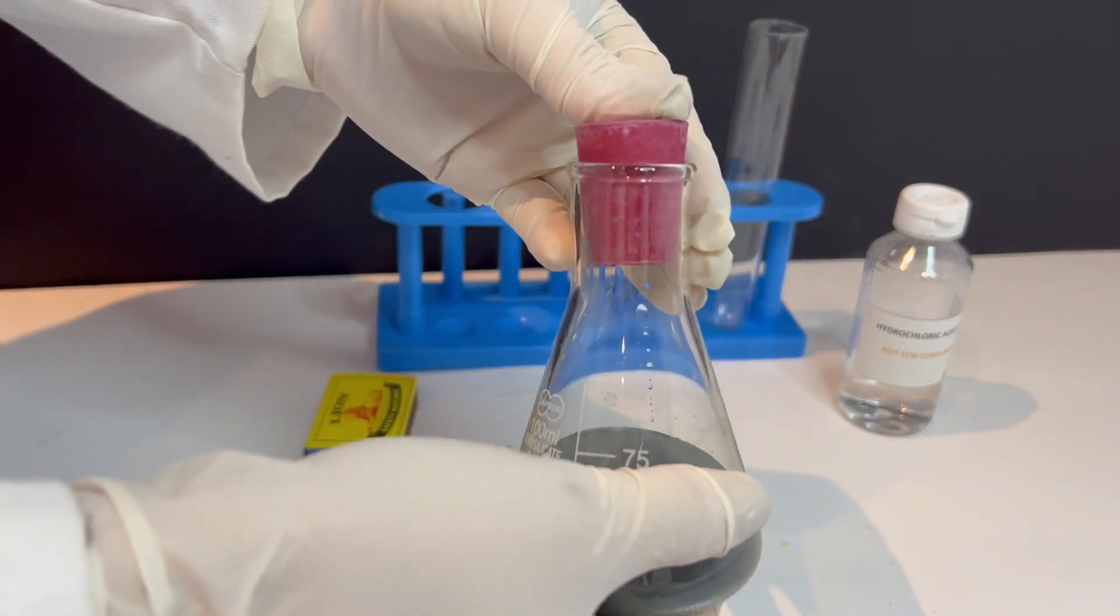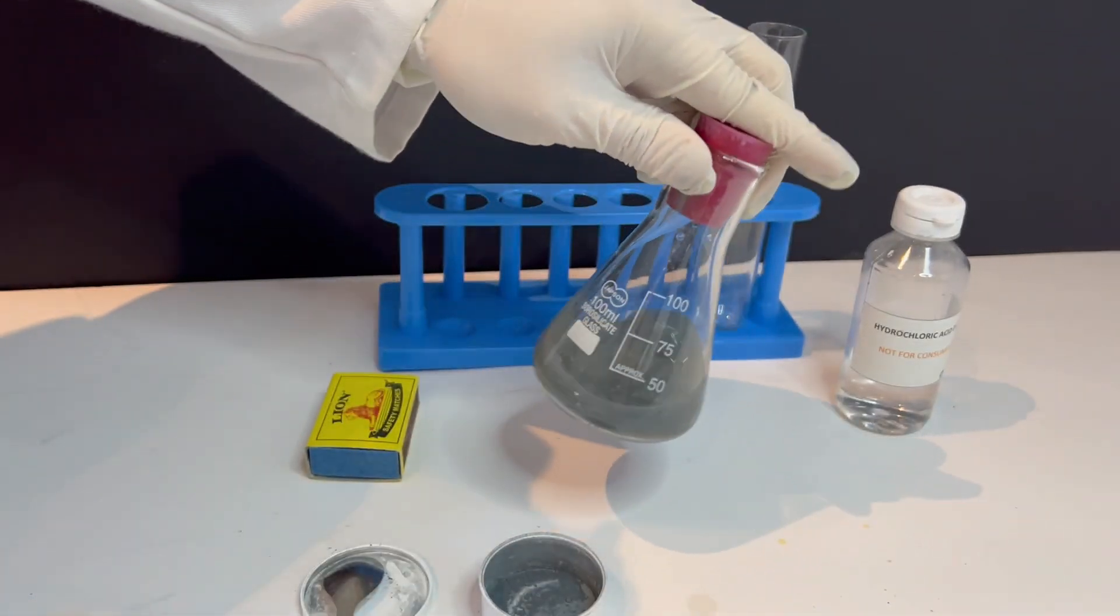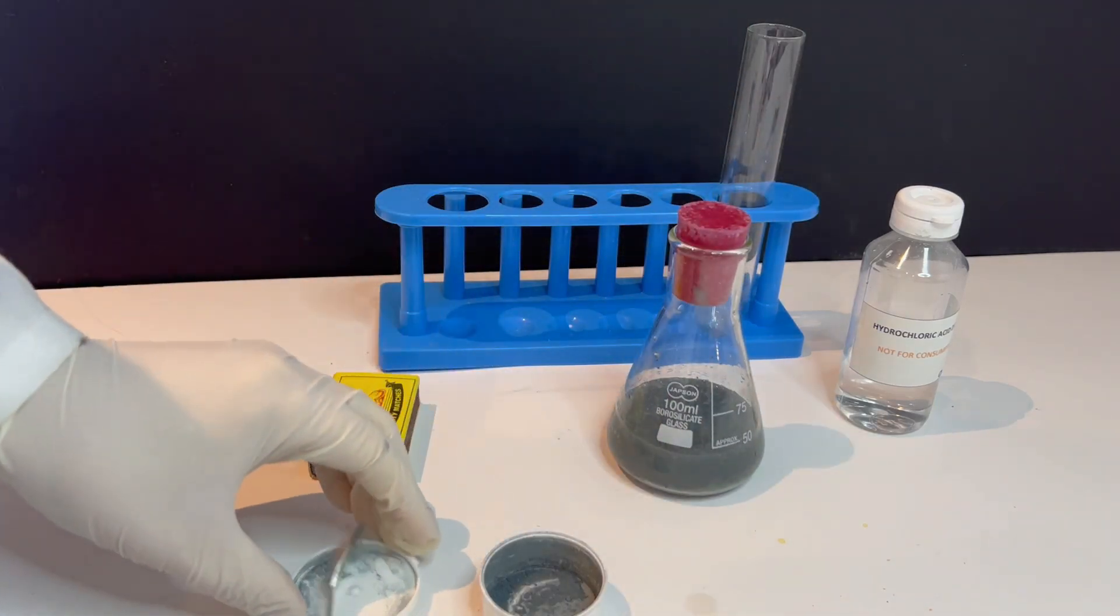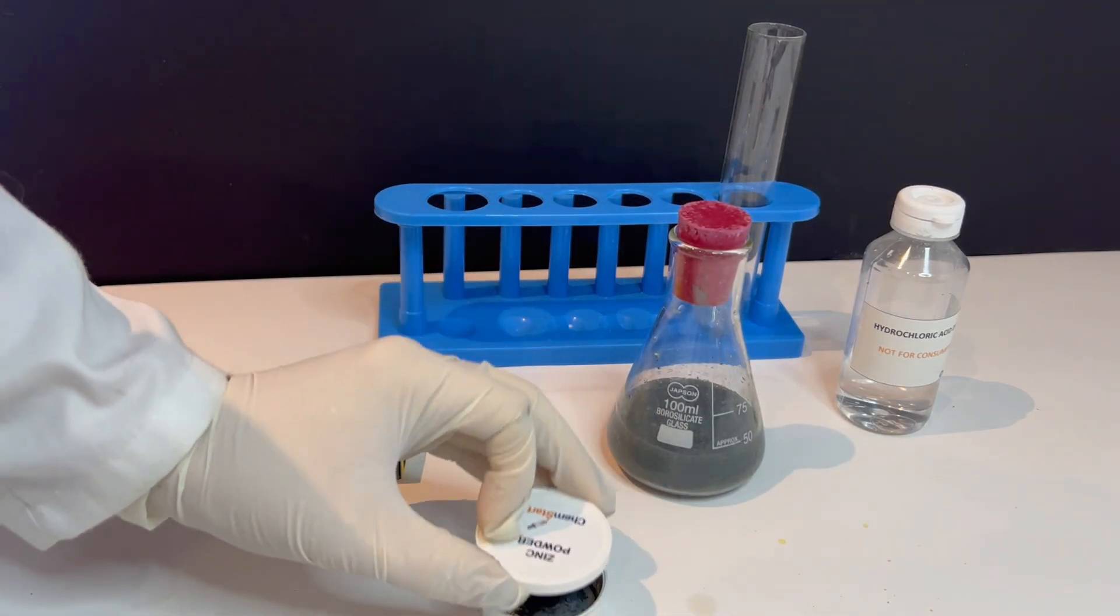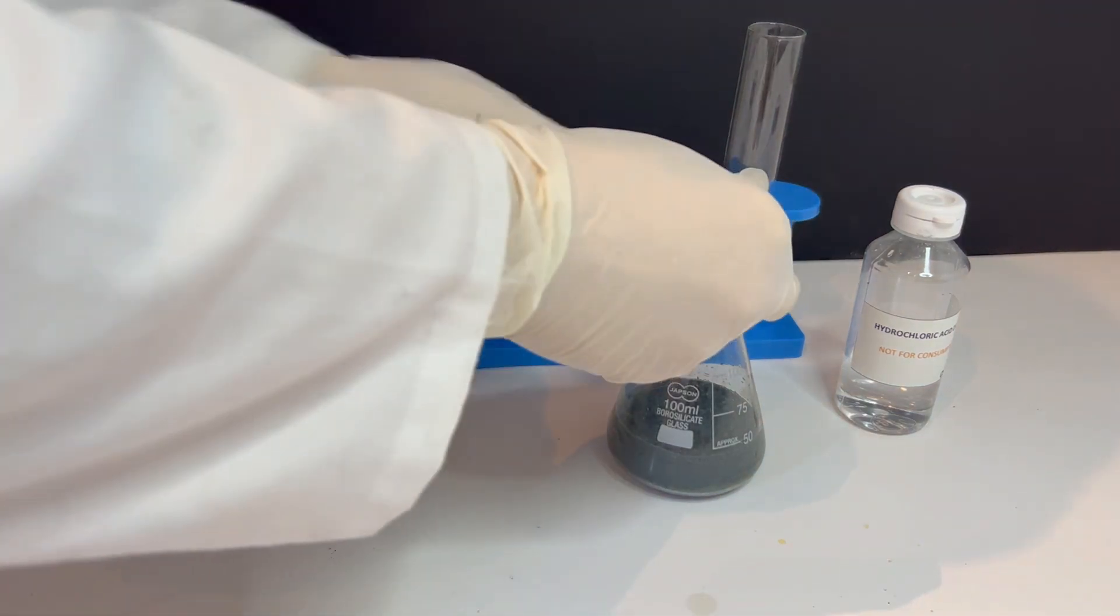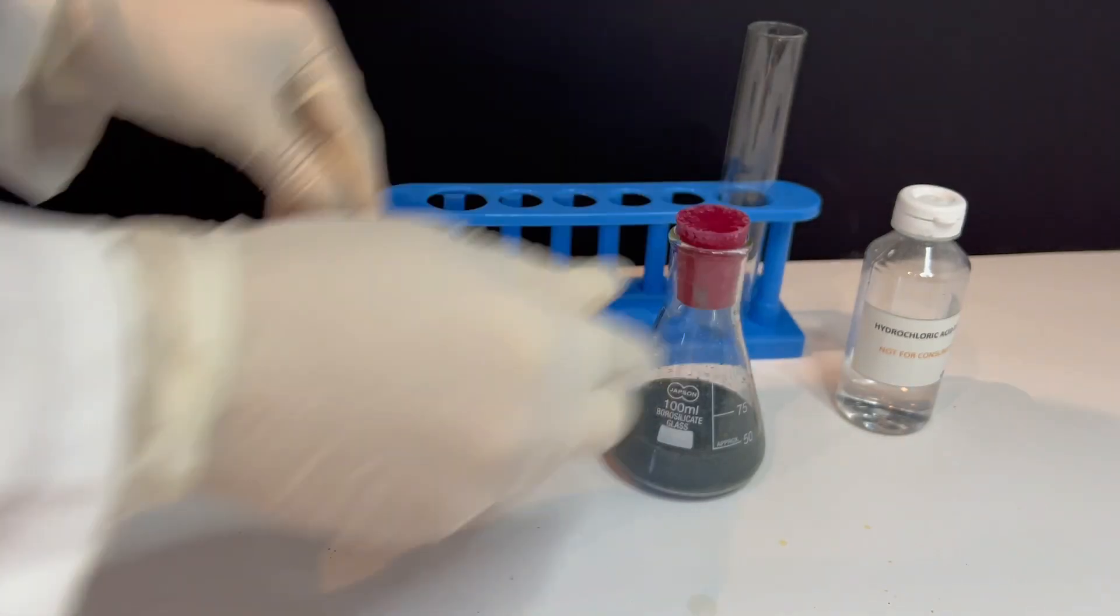That gas is hydrogen. The zinc reacts with hydrochloric acid to form zinc chloride, which stays dissolved in the solution, and hydrogen gas, which escapes as bubbles. So here's the word equation: zinc plus hydrochloric acid gives us zinc chloride plus hydrogen gas.